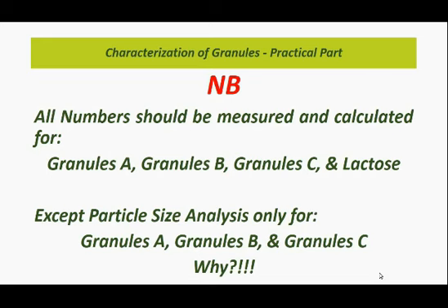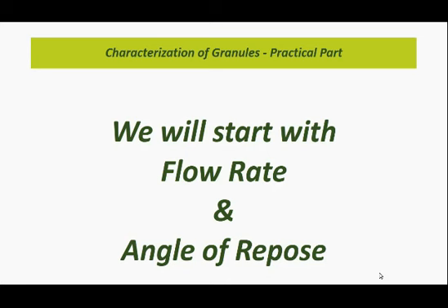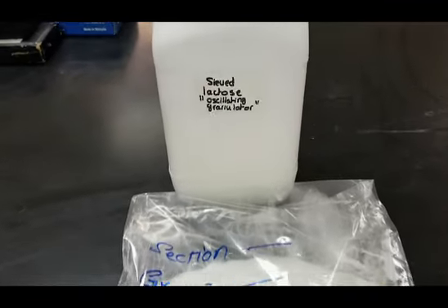Except particle size analysis, which will only be done for granules A, granules B, and granules C, because the analytical procedure we are using is not suitable for lactose. Please explain why. Now, we will start with the flow rate and angle of repose.